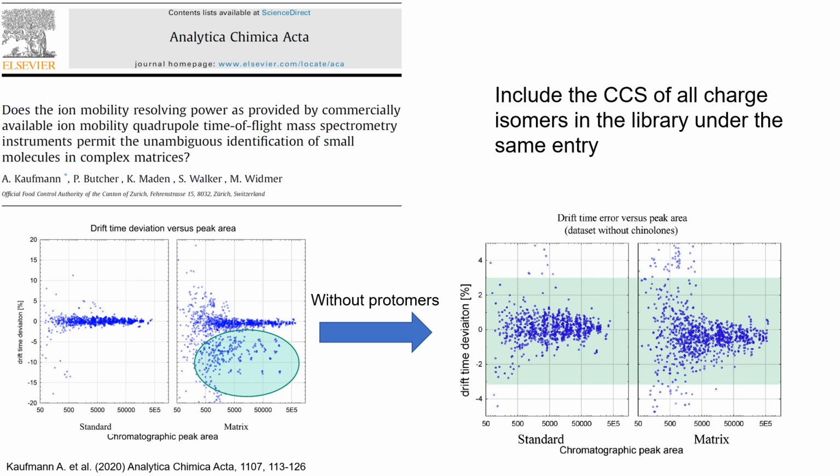When I validate a library for a number of food matrices, I usually encounter no false negatives above the established LOQ. But of course, this will also depend on the matrix.